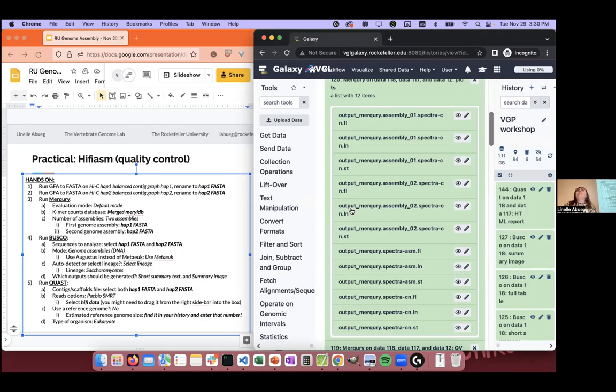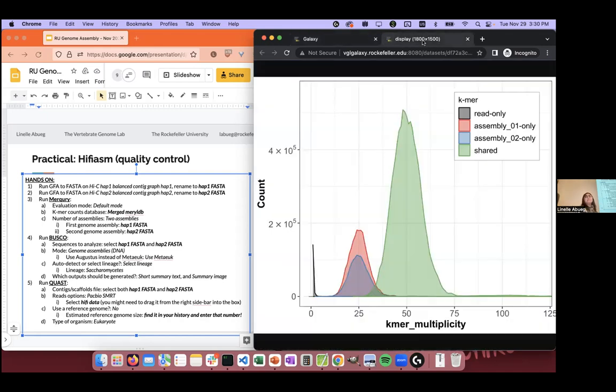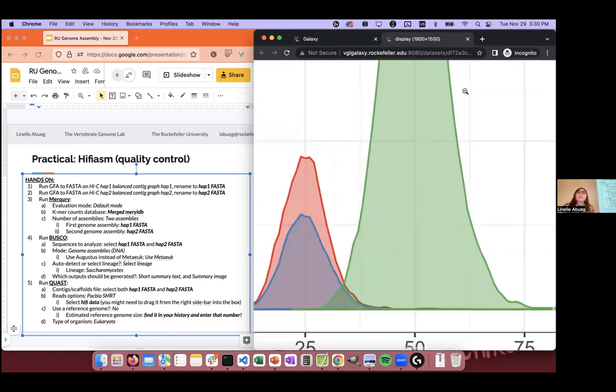Just one comment here, that this also speaks to the fact that many of the duplications that we see are actually caused by failing to resolve the haplotypes. So when you have information that resolves the haplotypes, trio and Hi-C data, you don't get the duplications.